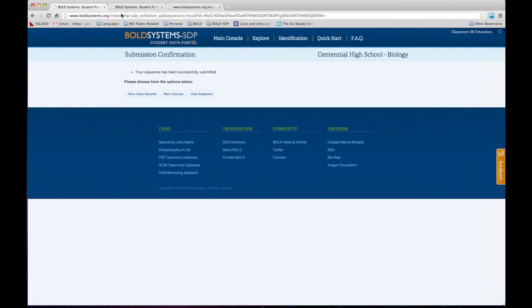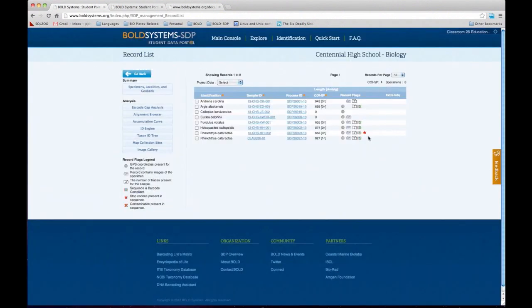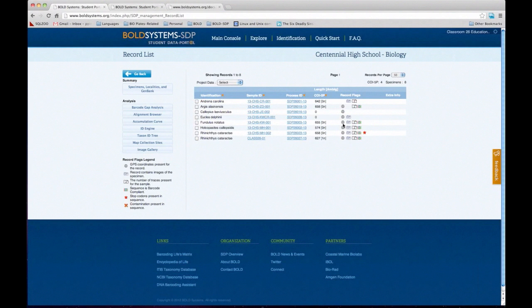That is a full record that we created on Bold. If I look at my class data, remember that we added two records. This will tell me what kind of information is on the record — the little globe tells me there are GPS coordinates, the camera tells me there's a photo, then there's the sequence flag. For a record to be complete, you actually have all four icons, and that tells me all four components have been added to that particular record.